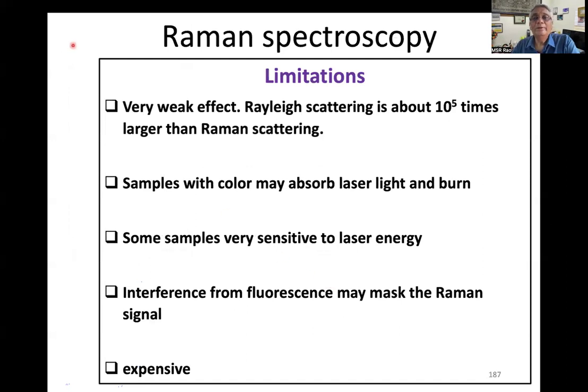Now, every technique has its own advantages and limitations. And what are the limitations of Raman spectroscopy? I also mentioned that of all the spectroscopy techniques, the scattering cross section in Raman spectroscopy is very small. So that's the reason why the effect is very weak.